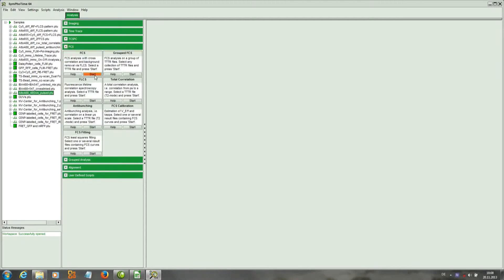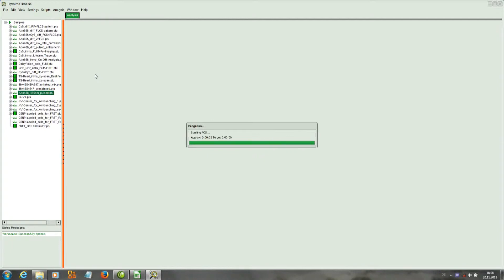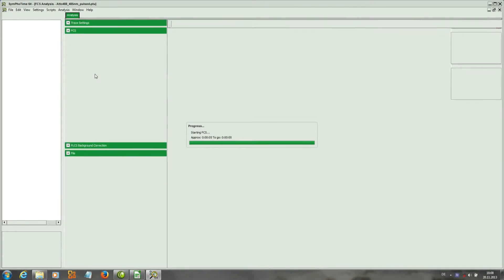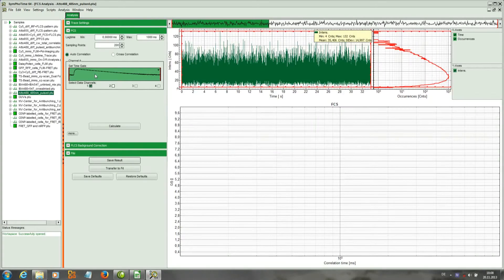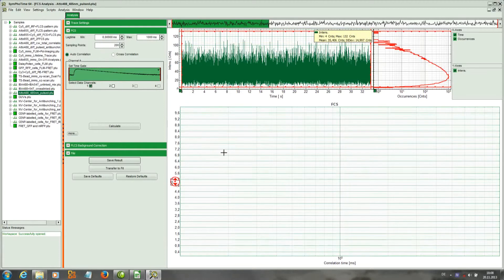We calculate the FCS curve of this dye using the FCS script. The measurement is loaded into the FCS script and a new window appears which contains the parameter area, the time trace area, and the area where the FCS curve will be plotted.